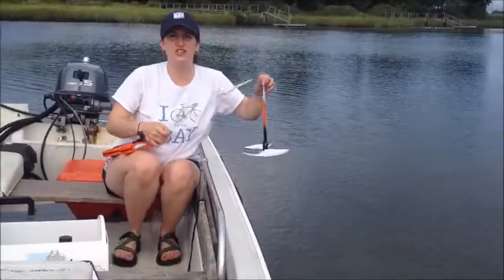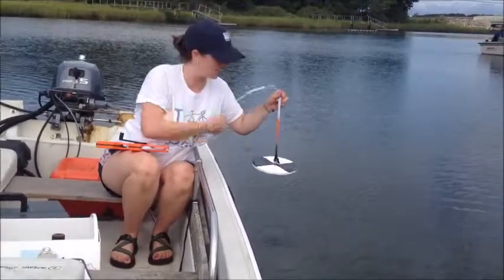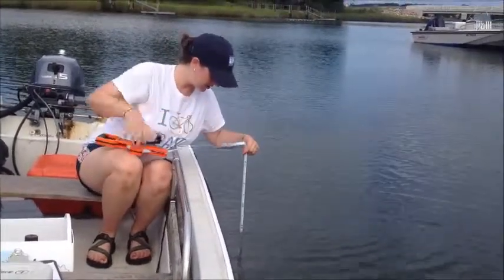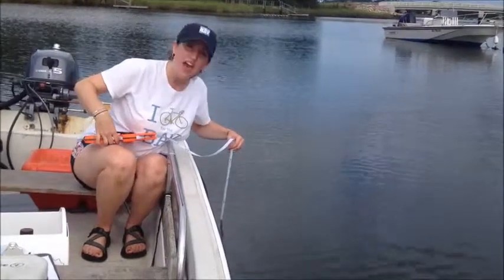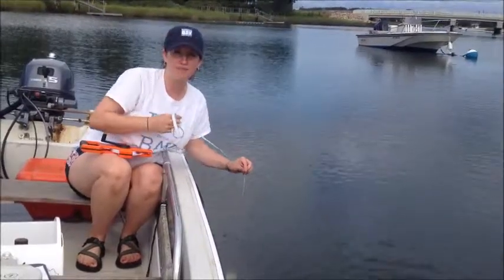We're about to measure water clarity with our Secchi disc. This is the Secchi disc. It's got a black and white face, and we're going to lower it into the water. You can see there's a measuring tape attached to it. We're going to lower it until it hits the bottom, or we can't see it, and it has hit the bottom at 0.8 meters. We can still see it, so the Secchi disc depth measurement is 0.8 meters, as is the total depth.